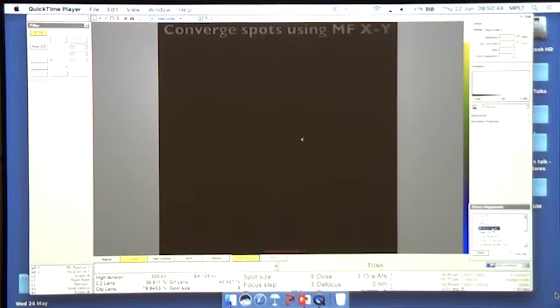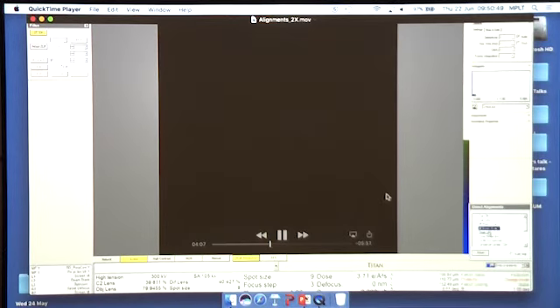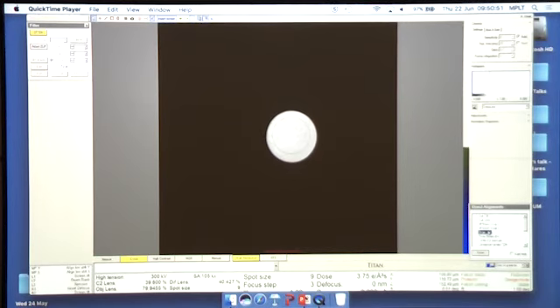So what you're doing here, the microscope is tilting the beam very rapidly, and you're making sure the pivot point is on your specimen. So you make those 2 points the same. The next step is the rotation center that I talked about. So this is making sure now that the beam goes parallel to the optical axis. So the microscope is going to start wobbling the objective lens current, and you're going to see things in the middle of your screen starting to move, and you just want to reduce that motion.